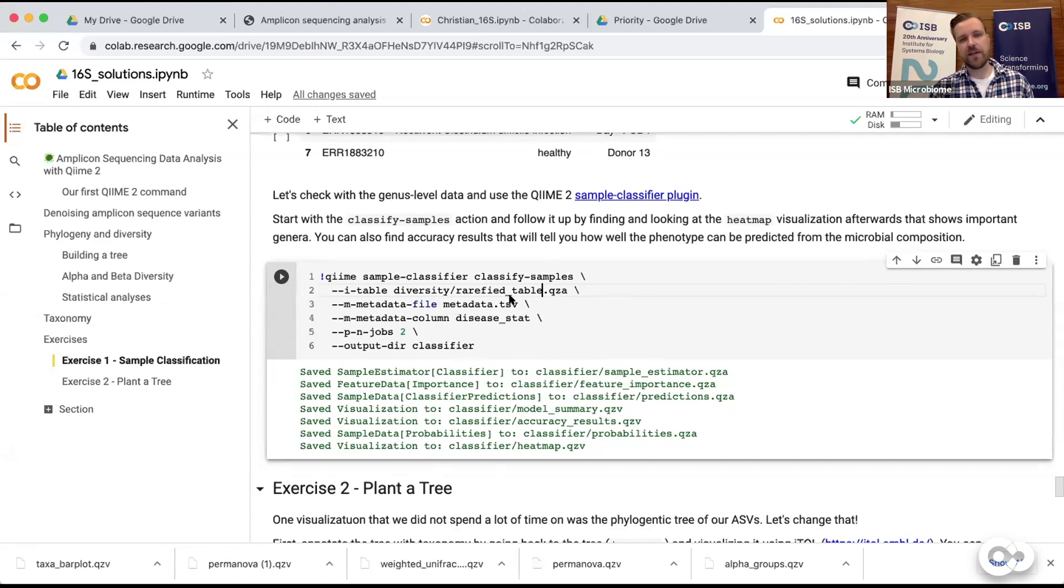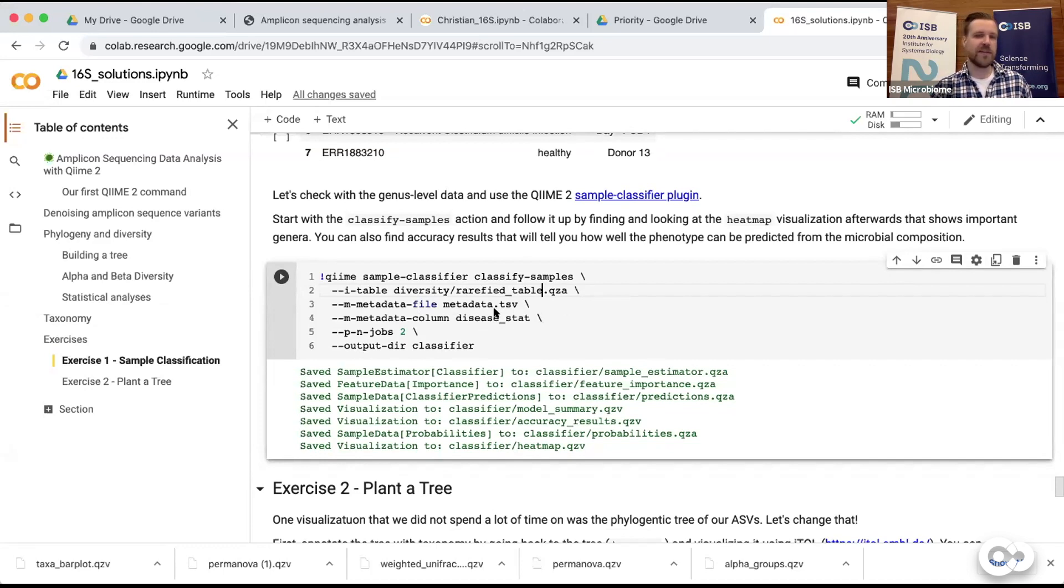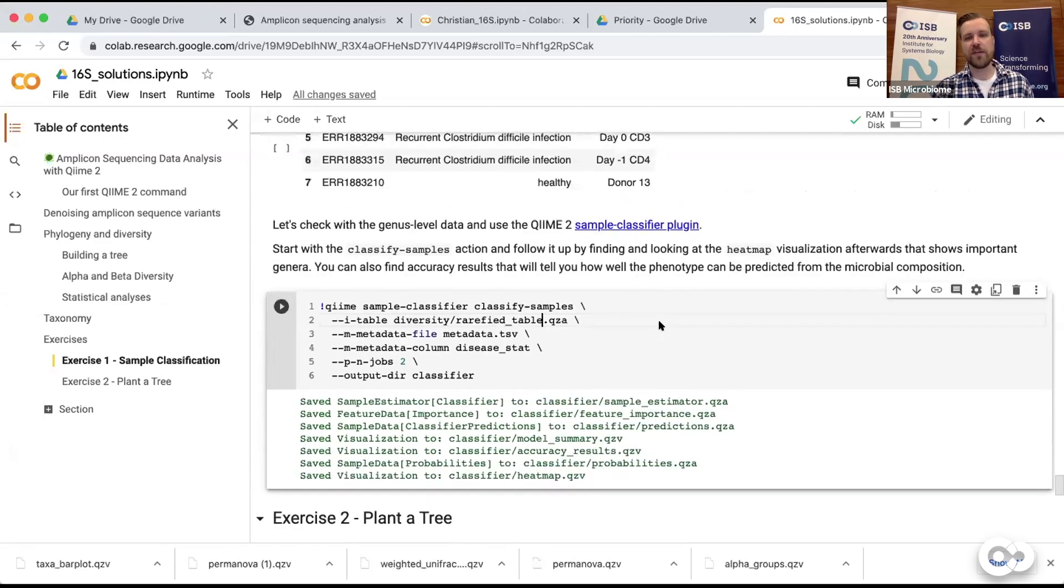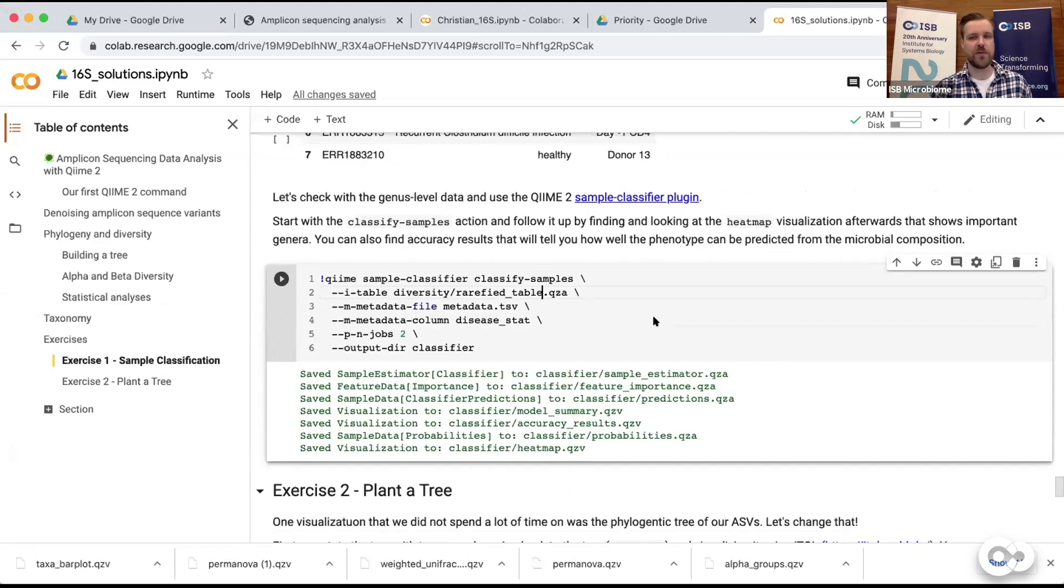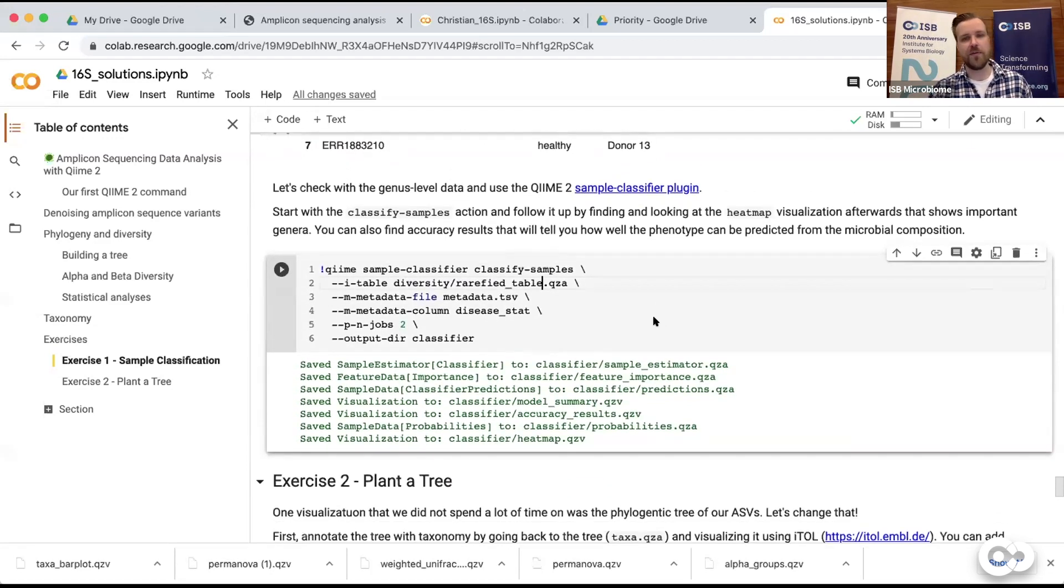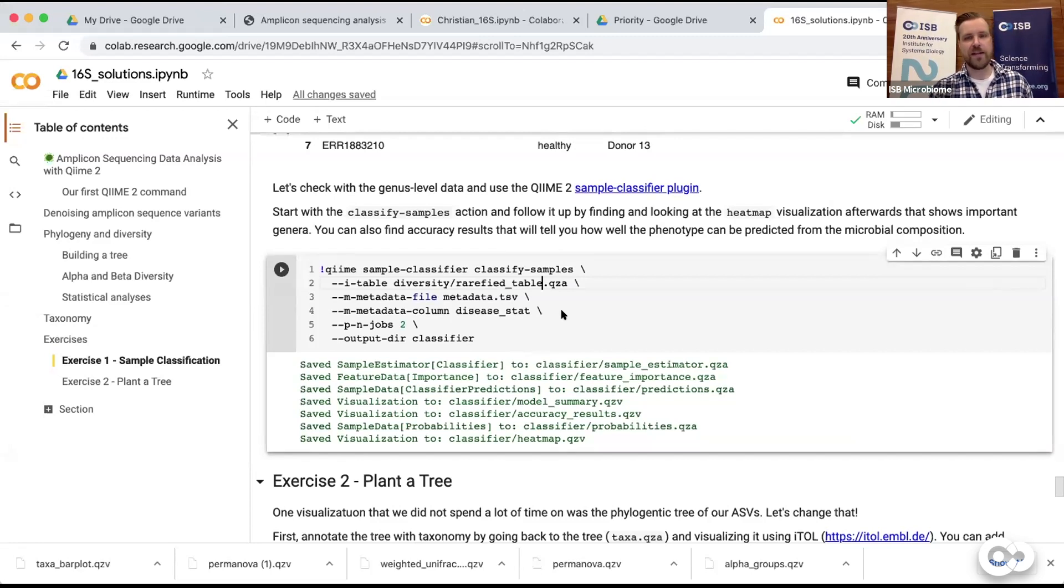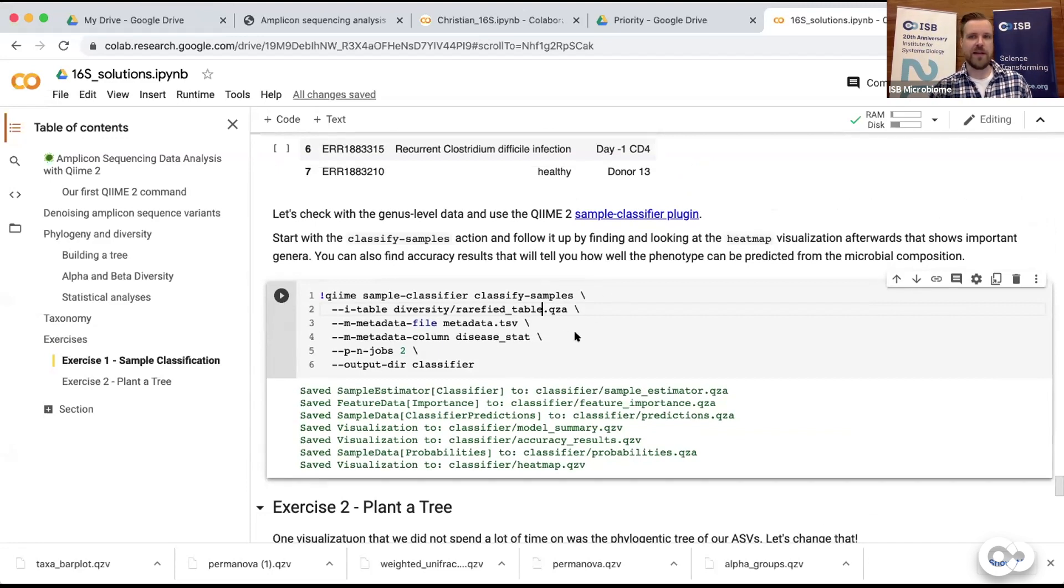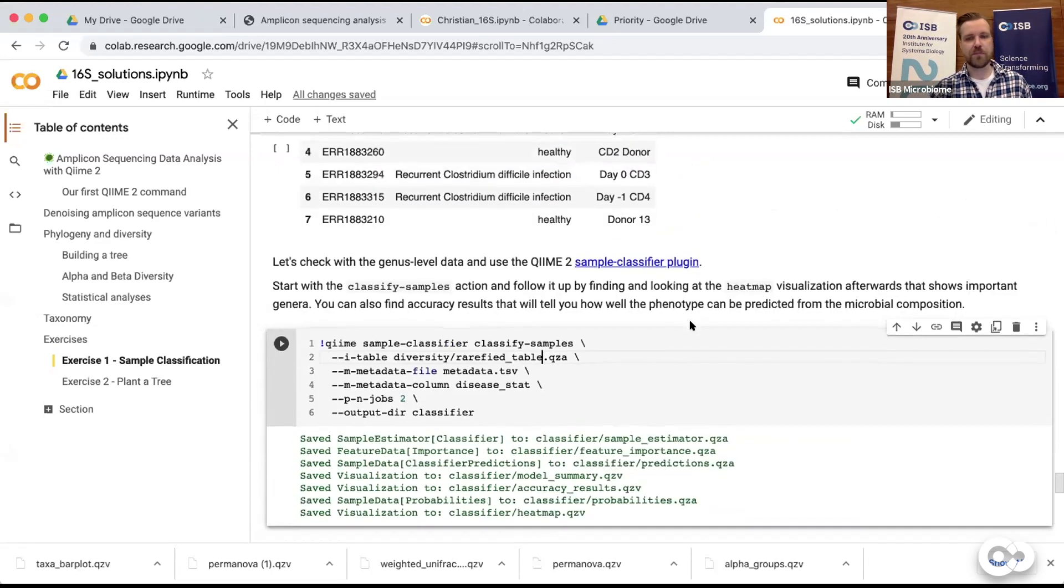Basically since the machine learning method that does the classification has a lot of different parameters it can fit to the data - way more than we actually have data points - it kind of over-captures the actual data and doesn't generalize well. If you would give it data that's not from that experiment it would probably do a pretty bad job of classifying it. We will look at that in the second part of the course with the MICOM analysis. I will show you the difference between using the entire data training data versus doing it with data that hasn't been used for training. We probably would still have a problem correctly classifying that one recurrent C. diff individual that looked almost like a normal healthy person.